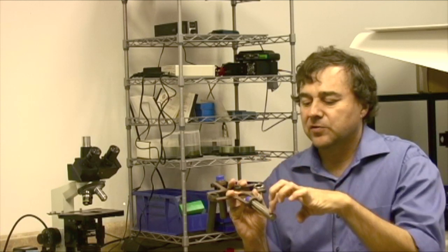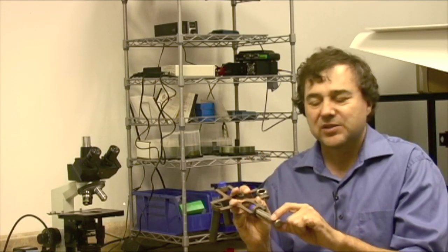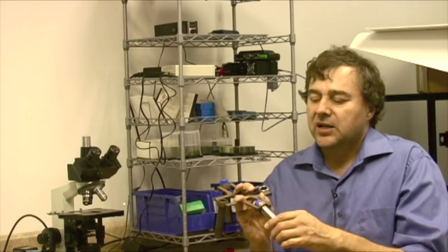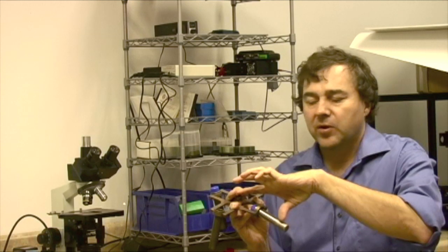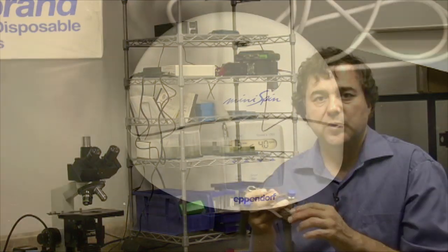The moment of a centrifuge arm is from the center of the rotor out to wherever the specimen is. Generally the longer the moment, the more g-force. G-force is a function of both the moment — the distance from the center — as well as the number of RPMs or rotations per minute.